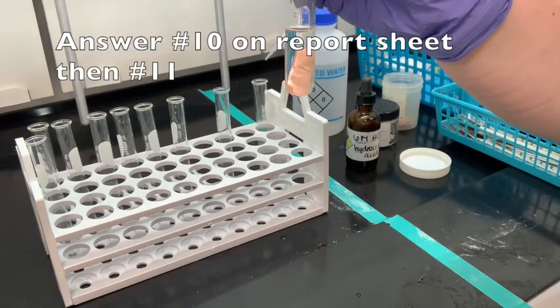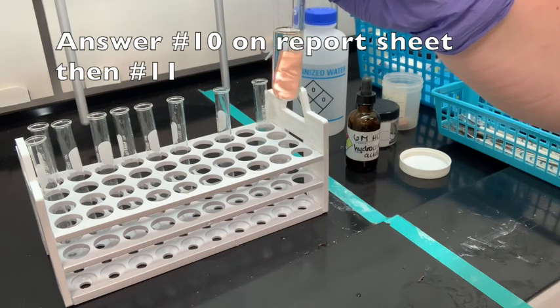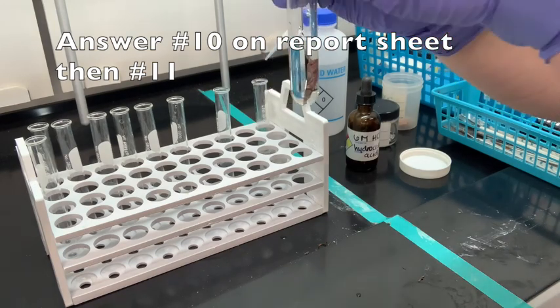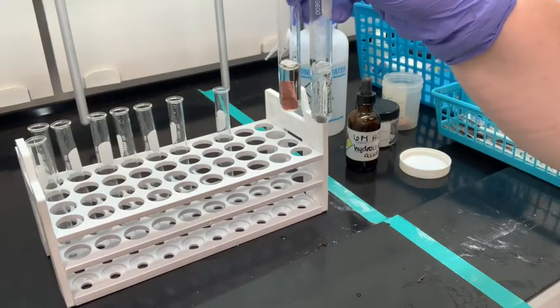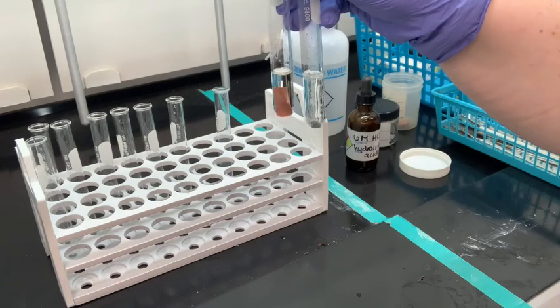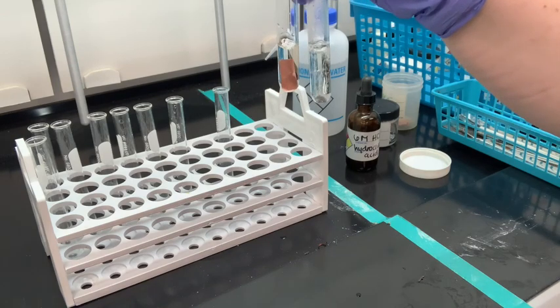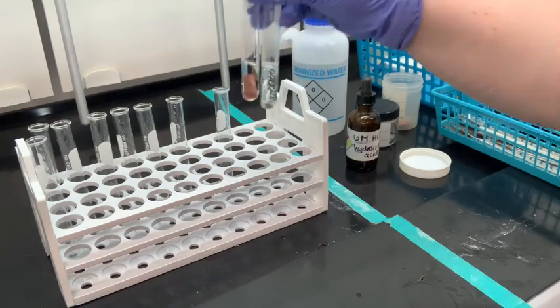And you can make your observations. Okay, so it appears that nothing is happening. And number 11 asks, is copper an active metal or an inactive metal? So just to compare the two that we looked at, on the left we have that copper and hydrochloric acid, and on the right we have the zinc and hydrochloric acid. So zinc is very active. We can see that bubbling still happening, that reaction still going on, and still nothing happening in the test tube with hydrochloric acid and copper.